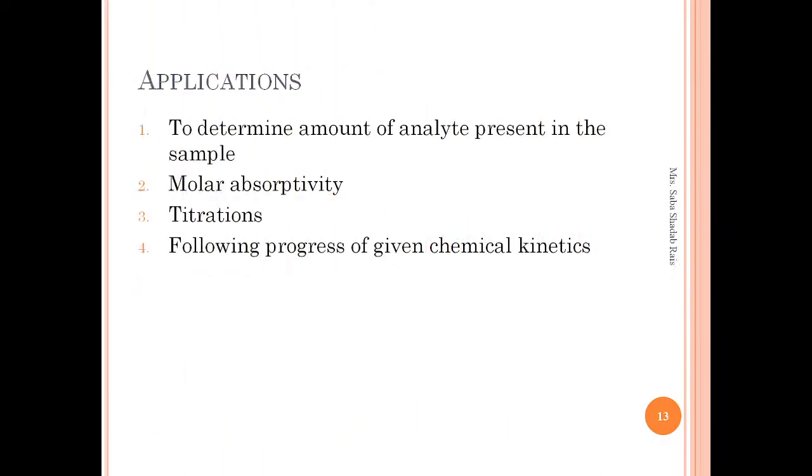Before we go on, I just want to tell you that the cuvette is your path length. Don't get confused: the cuvette decides the path length, that is, how much of the sample the light passes through.